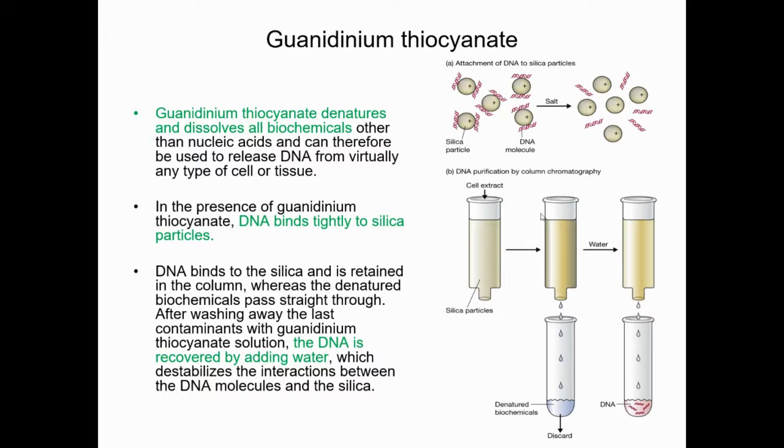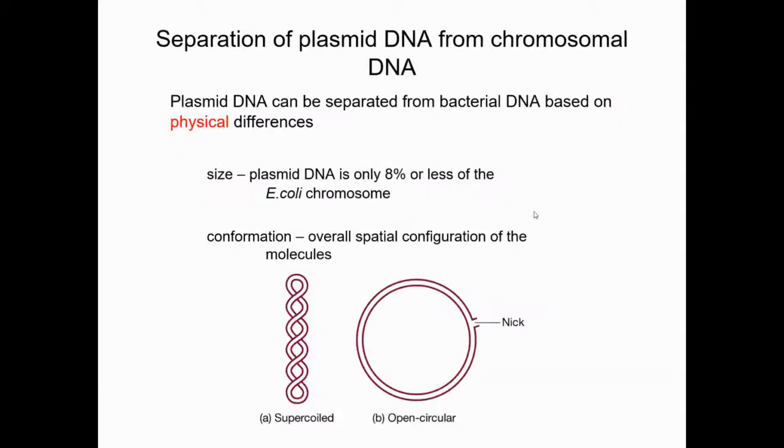So these are all the techniques you can use to purify the DNA from the cell. Next, we're going to focus on plasmid DNA. As we discussed in the past 2 days, if you introduce a plasmid DNA into the cell and put the cell in selective media, all the colonies you observe prove the recombinant phenotype.